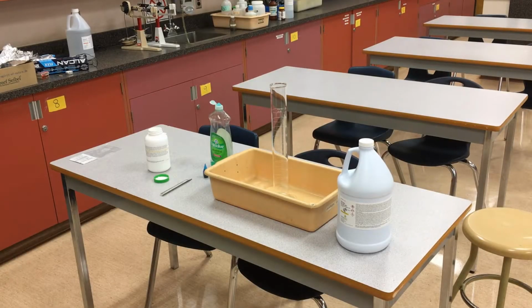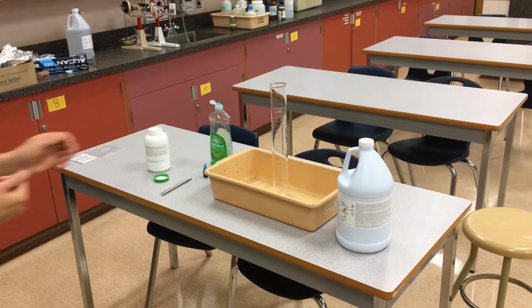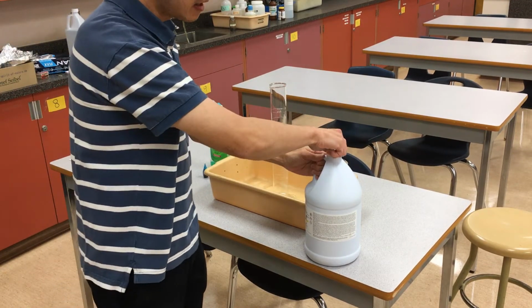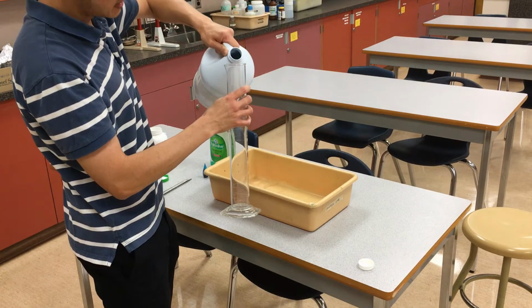Right, so in this demonstration, we're going to be doing elephant toothpaste. What it involves is using a chemical called hydrogen peroxide, H2O2. Because it is comprised of hydrogens and oxygens, it does look a whole lot like water. I'm just going to fill up this graduated cylinder.